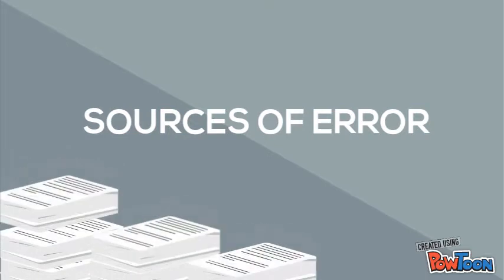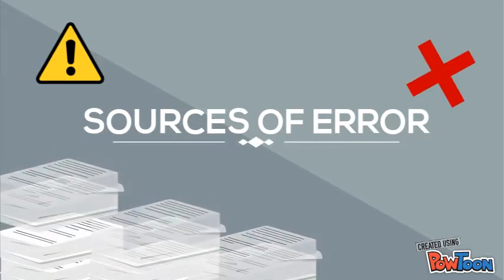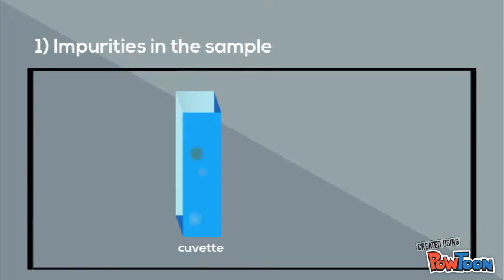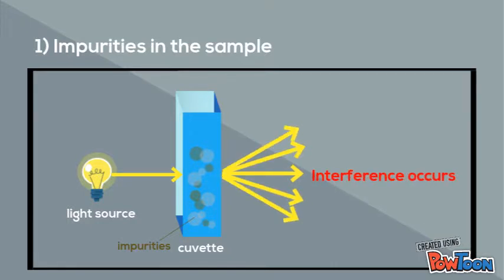Errors are likely to occur in every experiment and hence vary the outcome of the result, but it's important to avoid them at any rate. First, impurities in the sample may cause an error. The light entering the cuvette encounters small particles or grime, which causes interference and leads to a deranged value.